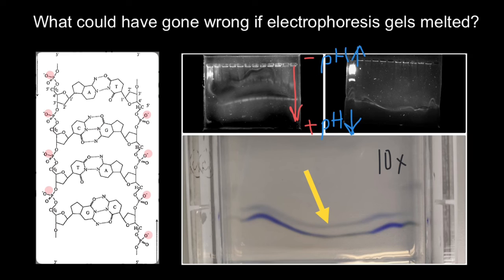So as you see, not only voltage important, but also concentration of the buffer. Both of them may lead to such gels, as you see in these pictures.